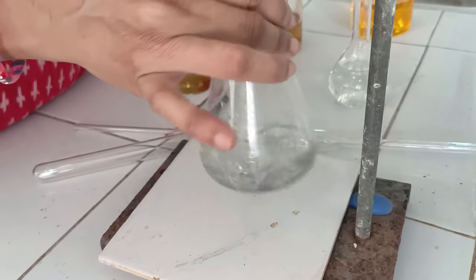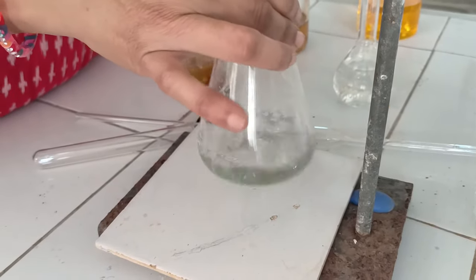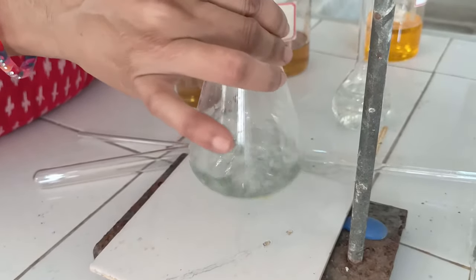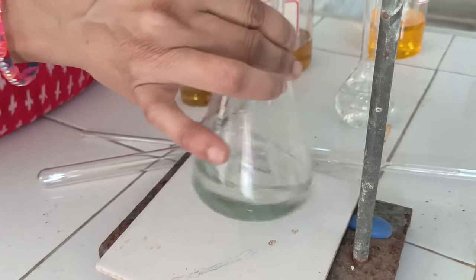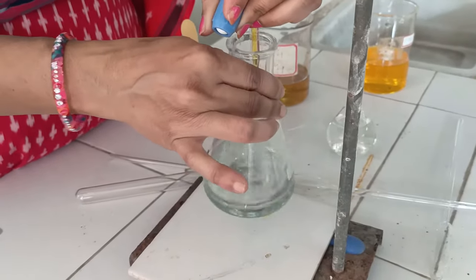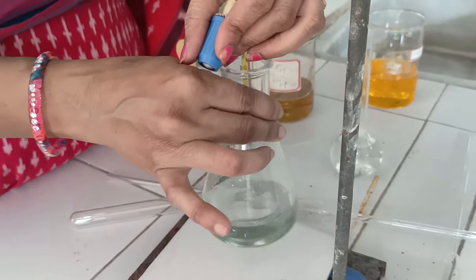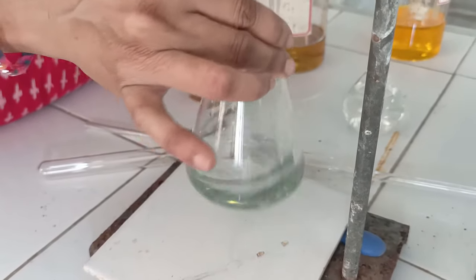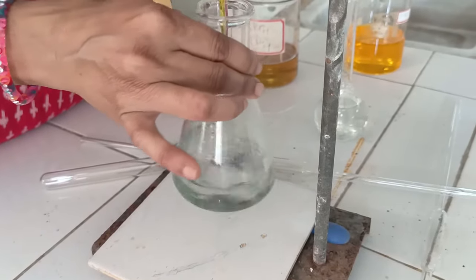Shake the flask thoroughly with every drop you add. Continue adding potassium dichromate solution. You will see a green coloured solution forming. This green colour confirms the formation of chromium in the plus 3 oxidation state — Cr³⁺ is responsible for the green colour formation.